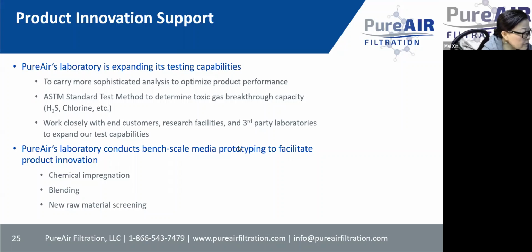Another question is: is there a standard thickness of copper and silver needed on a coupon? I think there is a minimum requirement for silver and copper on the coupon, because sometimes people use the whole metal strip.